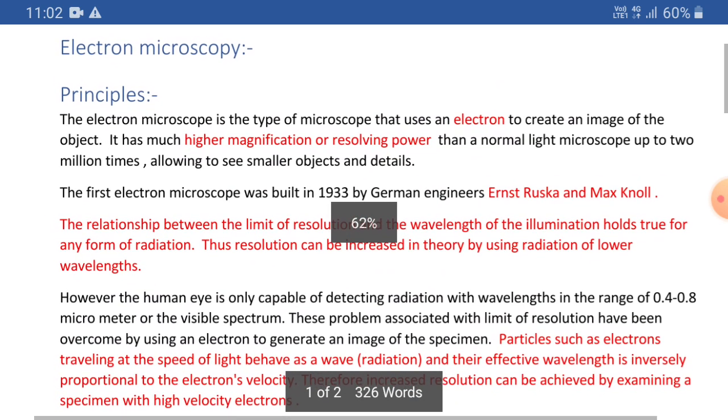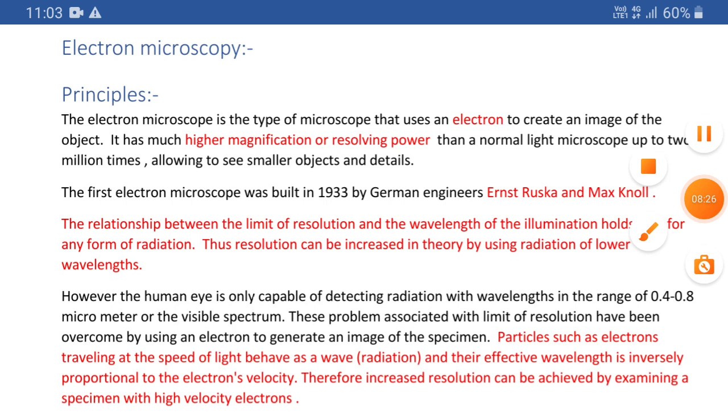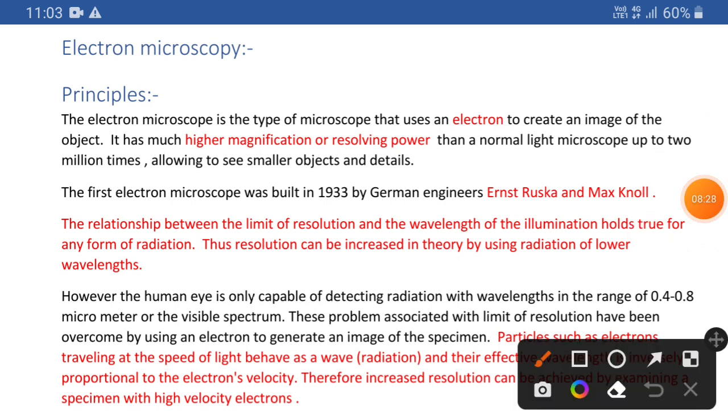microscopy, right? So under such circumstances scientists decided to construct another microscopic technique that will allow them to achieve a further magnification along with resolution.